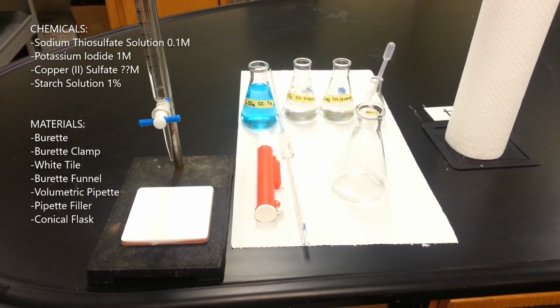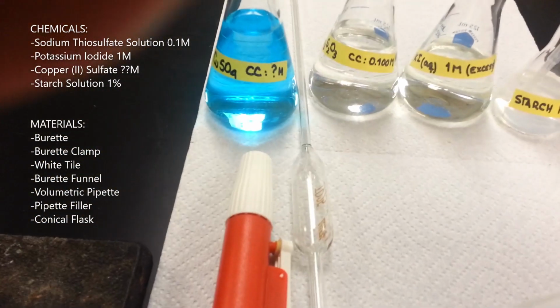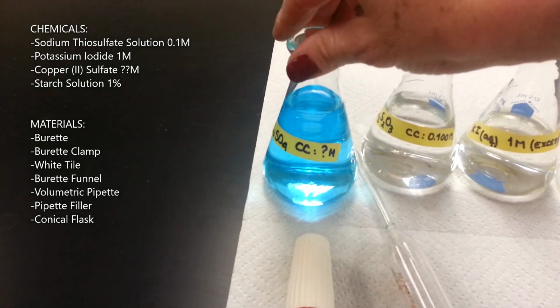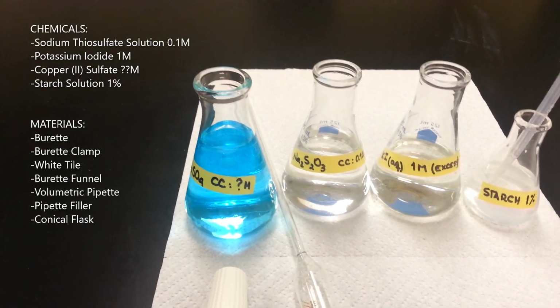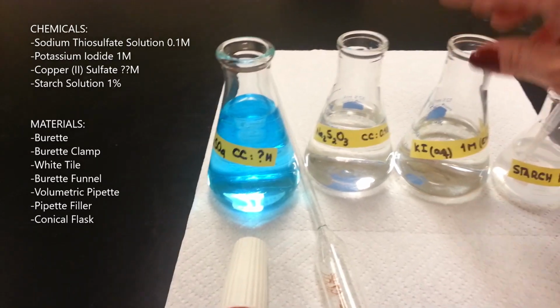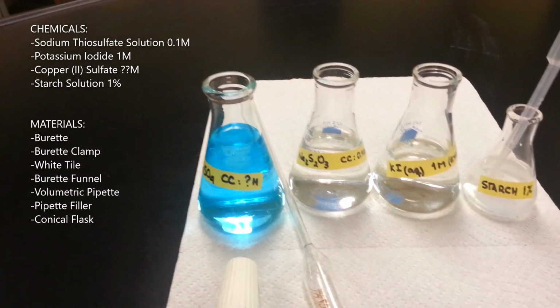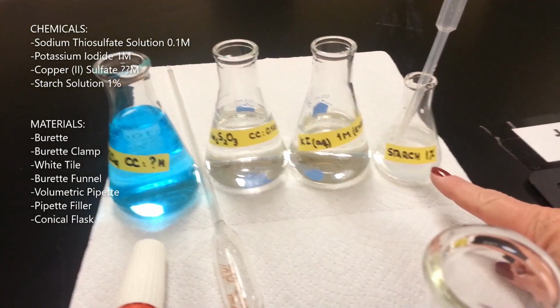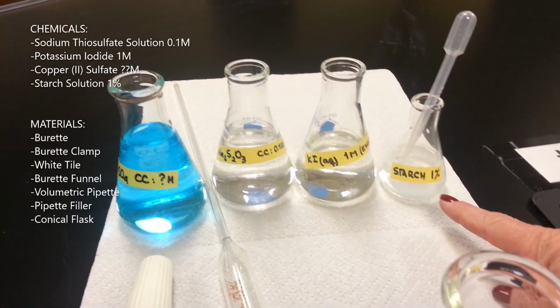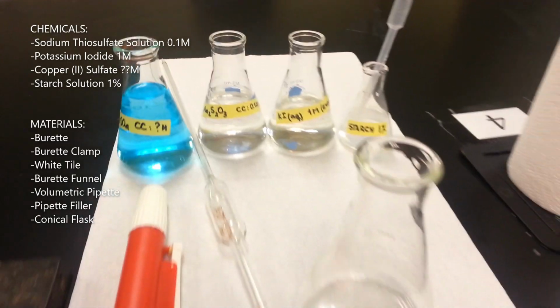This is a redox titration. In this case, we are going to calculate the concentration of the copper sulfate solution here using sodium thiosulfate to perform the titration, and potassium iodide, which is going to react with the copper sulfate to produce the iodine in solution. The starch, to show the presence of iodine, is going to act like an indicator, that is 1%.